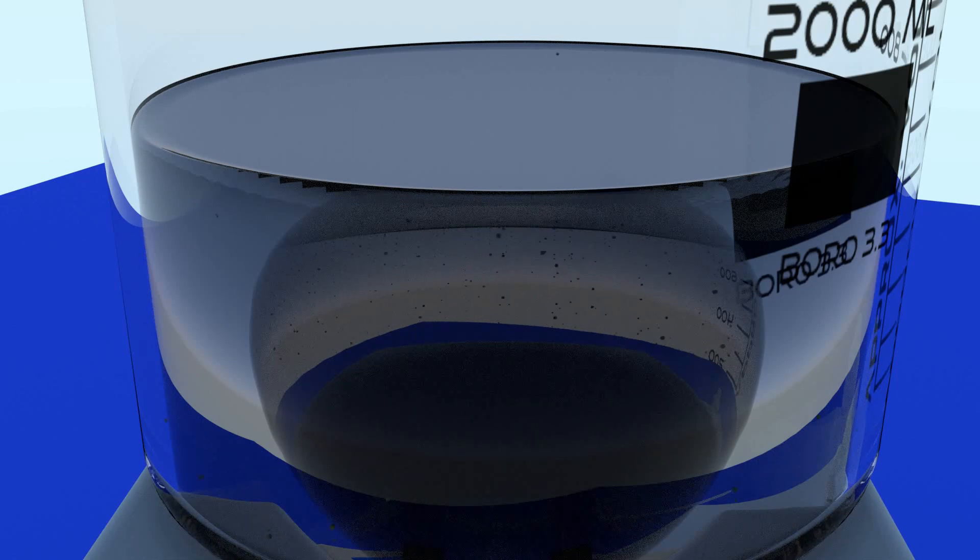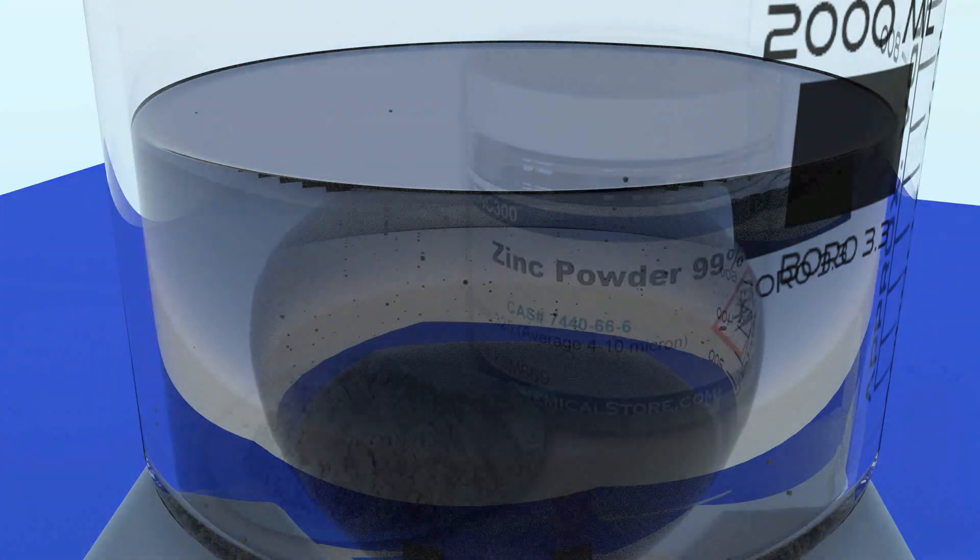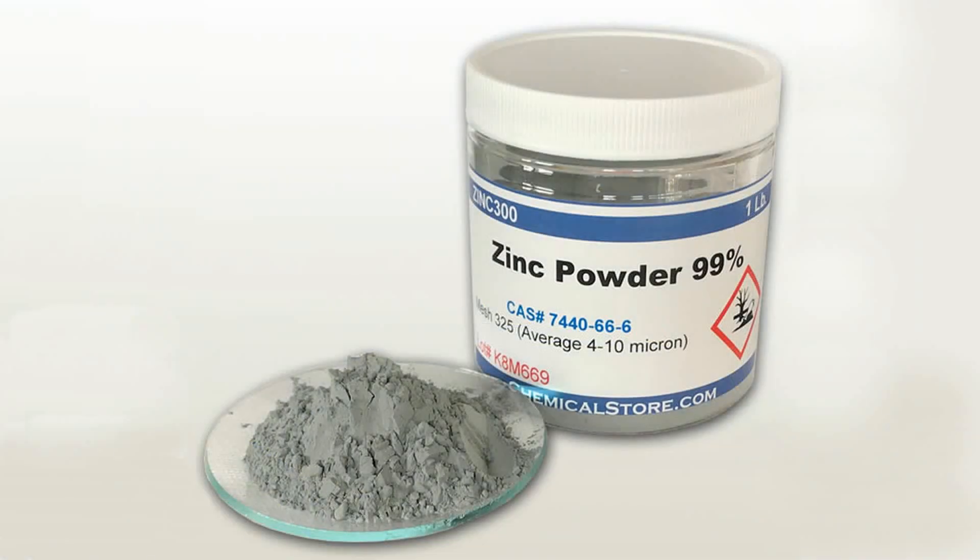The non-precious metals remain dissolved in the solution. Commonly, these heavy metals are removed from the waste solution by the addition of a non-selective precipitant, such as zinc powder or aluminium foil. The zinc or aluminium dissolves, precipitating the heavier metals.